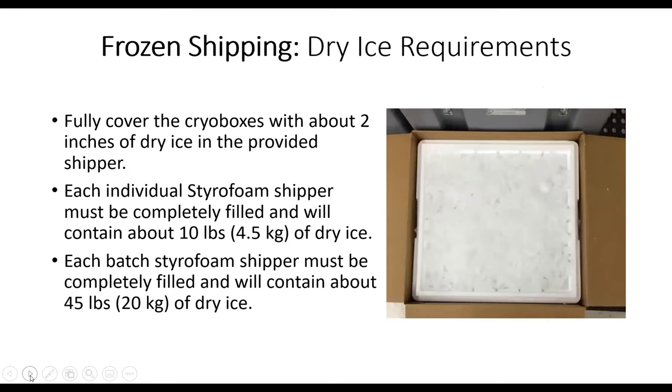For the dry ice, please put some dry ice at the bottom of the box. Then you will put your biohazard bags with the cryo boxes inside there. If it's the screening visits, you'll have 1 or 2 cryo boxes per shipper. If it's the other visits, you will have up to 6 cryo boxes per shipper.